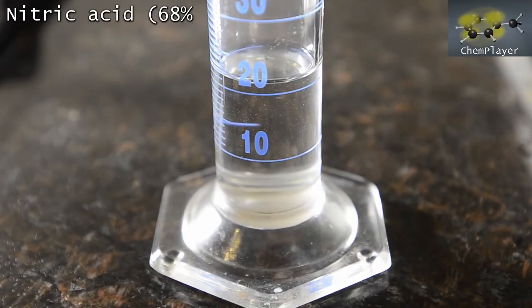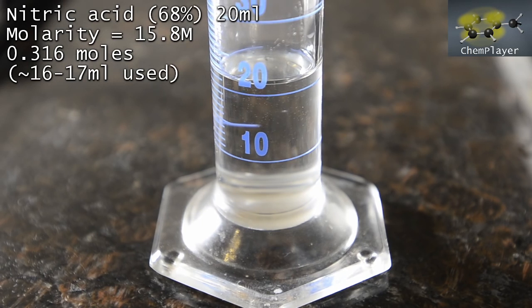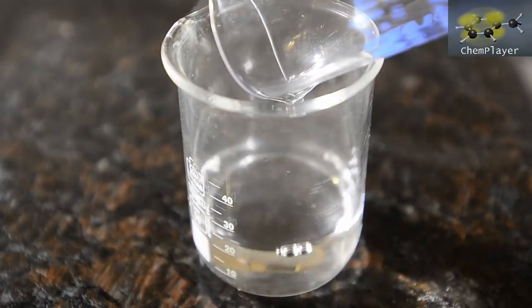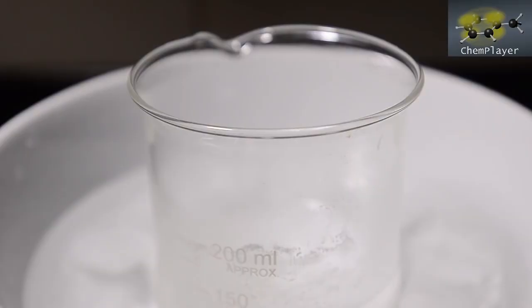So let's prepare our nitrating agent. Here we've measured out 20 ml of 68% concentrated nitric acid. In theory about 16 ml of this represents a 1-to-1 molar ratio to the vanillin, but we'll see how much we need to use as we go along. Let's get this into a beaker so we can add it dropwise to the reaction mixture.